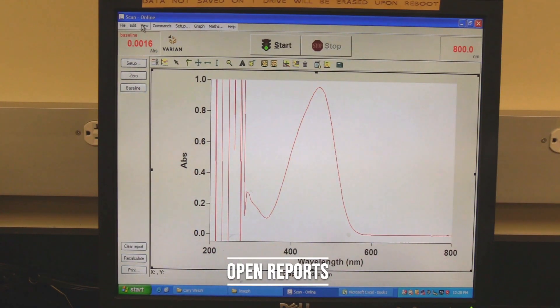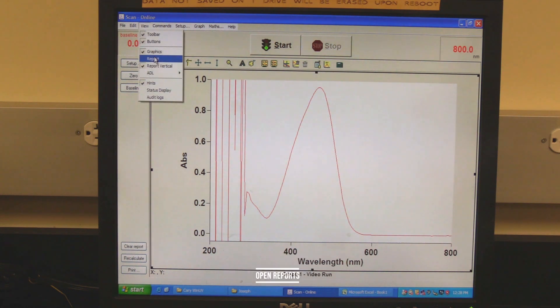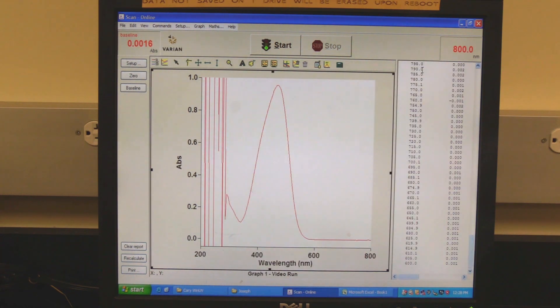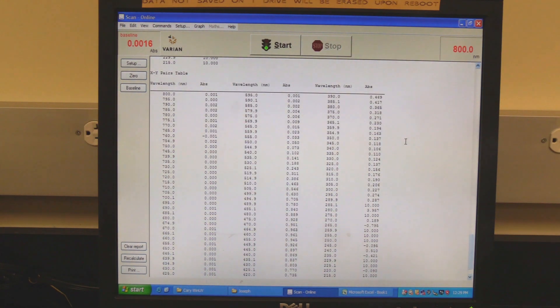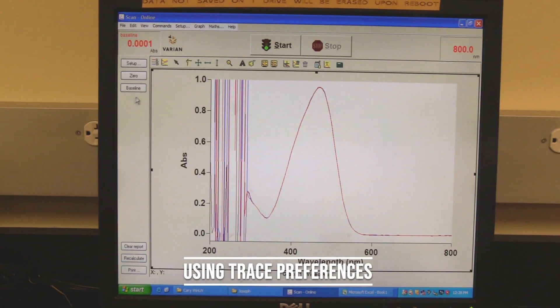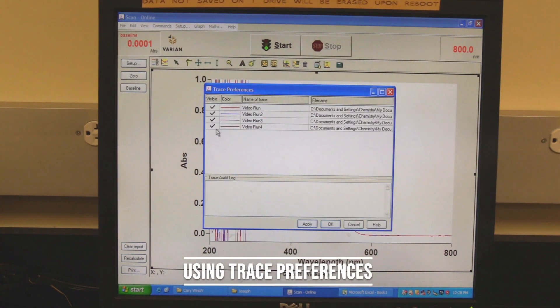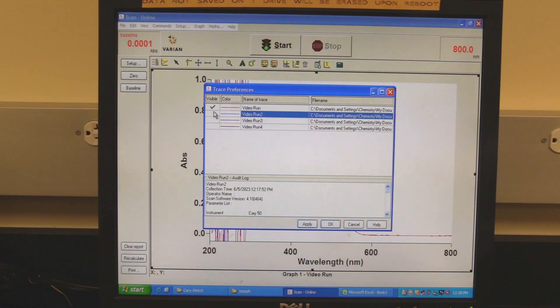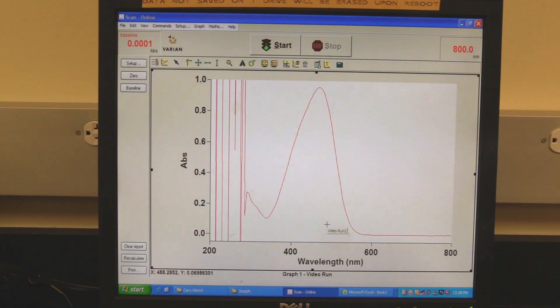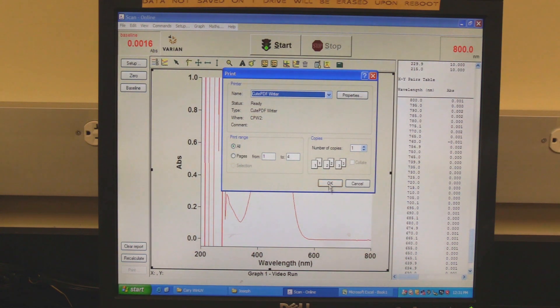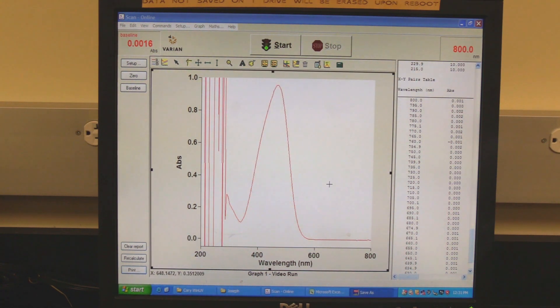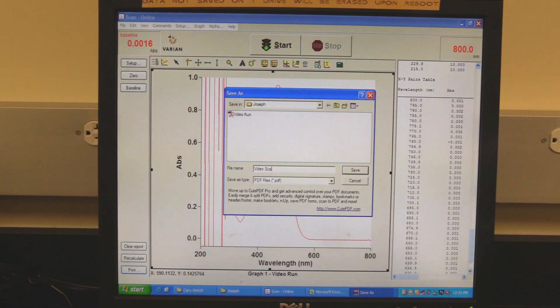Open Reports. If the Reports window is not open, go to View and then click on Reports. Double-click in the Reports window to expand it to full view. Double-click again to collapse it. Using Trace Preferences: click on the Trace Preferences button above the spectrum, check or uncheck the desired spectrum, then click OK. To save your report as a PDF, click on the Print button, select Cute PDF Writer as the printer, click on OK, then save the PDF file in the desired folder.